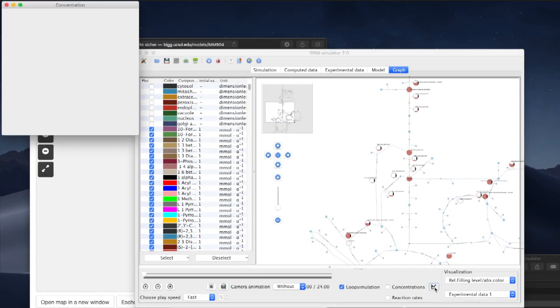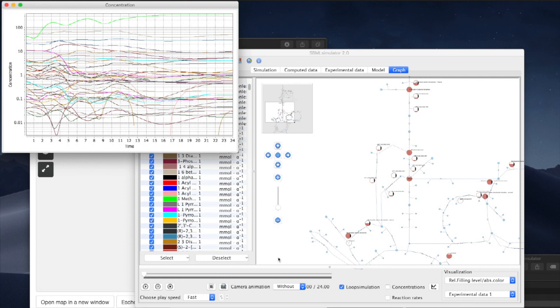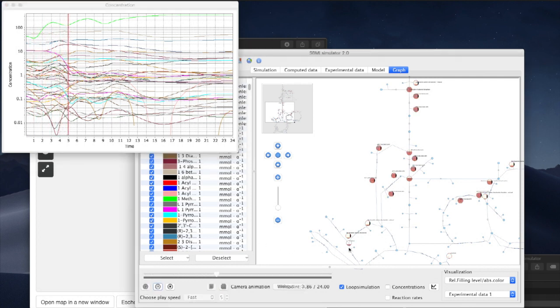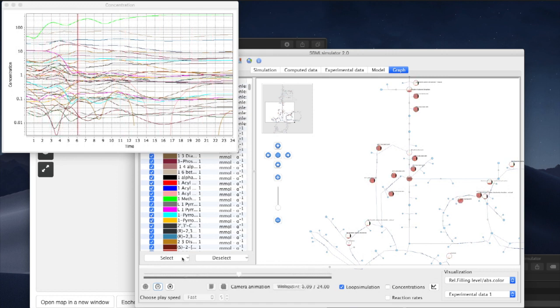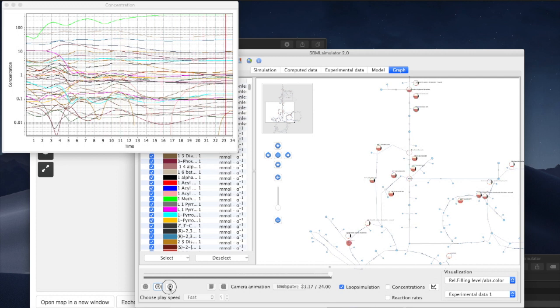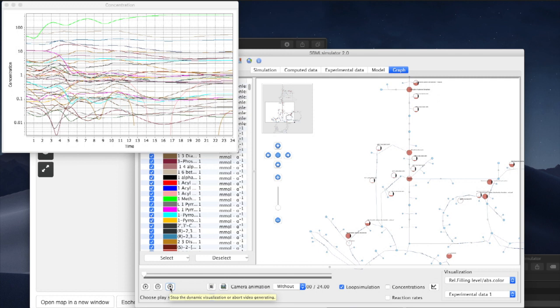When we click this button, we see a diagram of all variables within our dataset and a red vertical bar indicating the current position moving in sync with our animation. This view allows us to compare different visual representations and to directly observe the most active spots in our network.